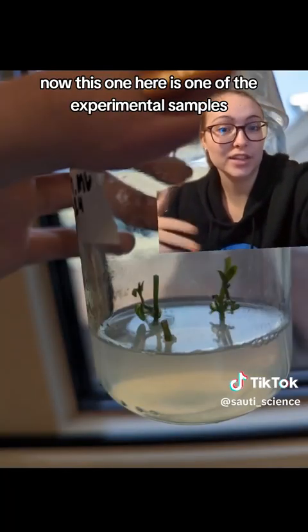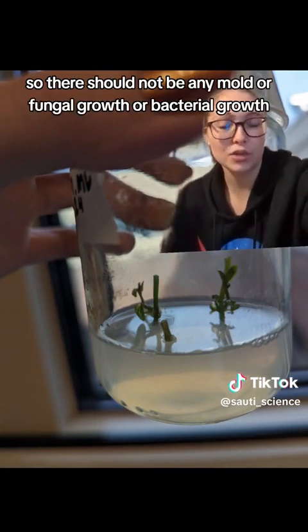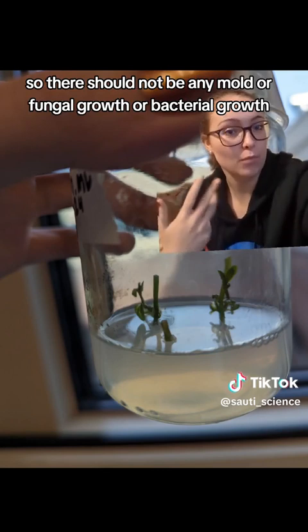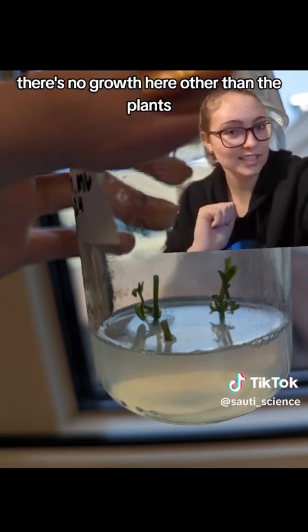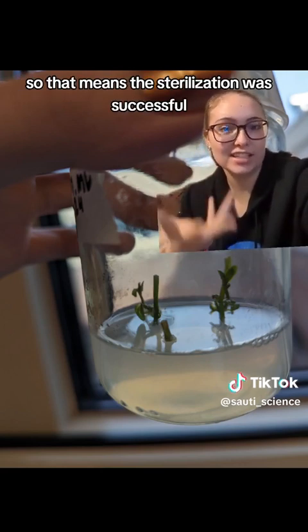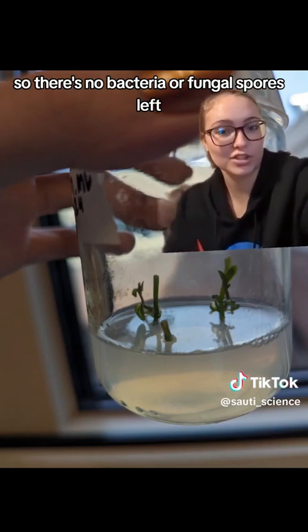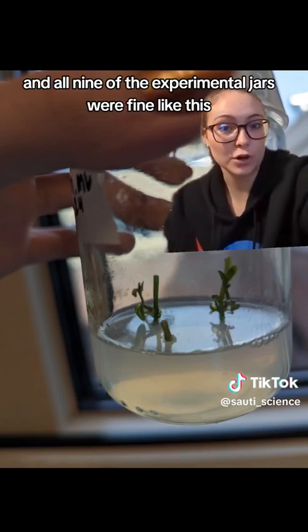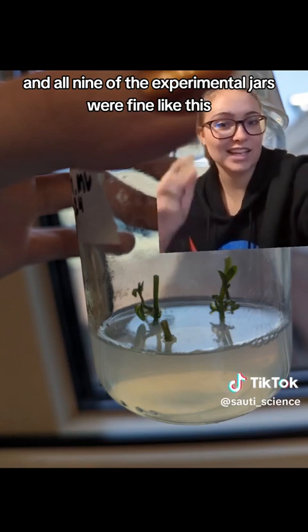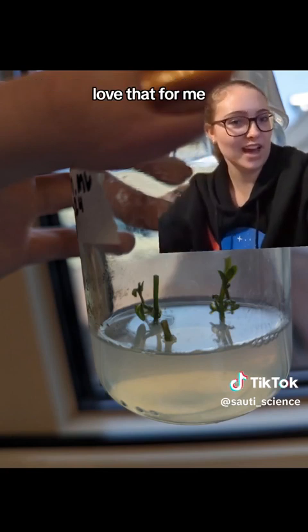This one here is one of the experimental samples. The plant tissue has been fully sterilized, so there should not be any mold, fungal growth, or bacterial growth if the sterilization went properly — which you can see, there's no growth here other than the plants. That means the sterilization was successful. All nine of the experimental jars were fine like this, which means I didn't contaminate anything. Love that for me.